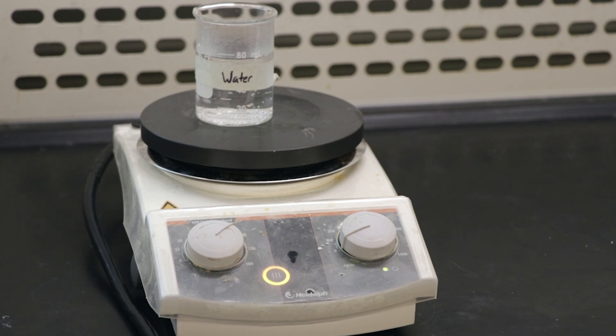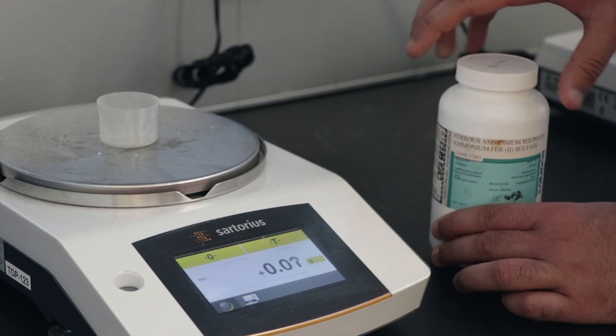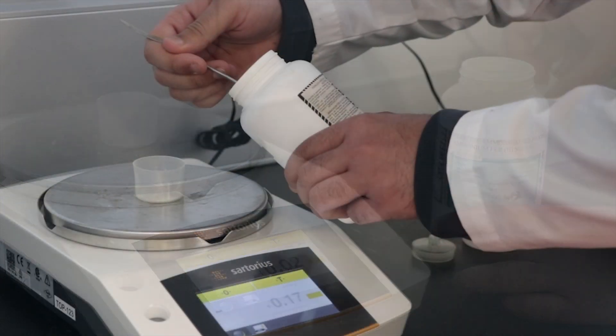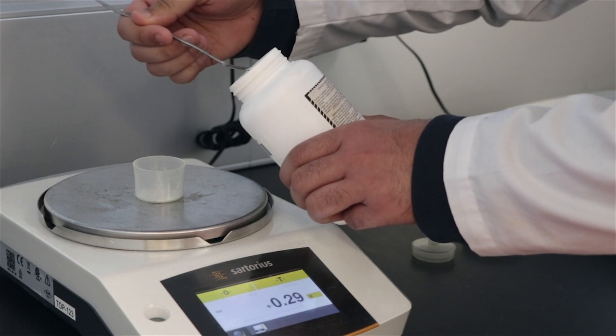First, heat up about 50 ml of water on your hot plate. While your water is heating, go to the top loading balance and tare your weighing bottle. Weigh out approximately 4 grams of ferrous ammonium sulfate. The weight does not have to be exactly 4 grams, but make sure to record the mass you measured.